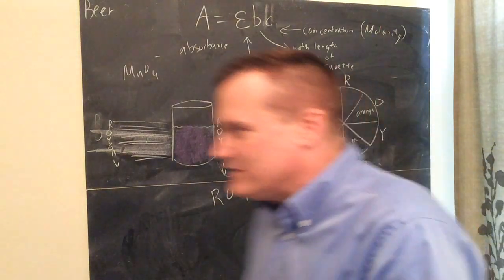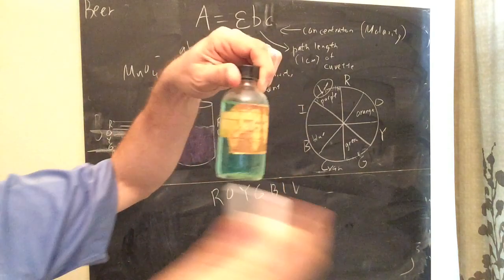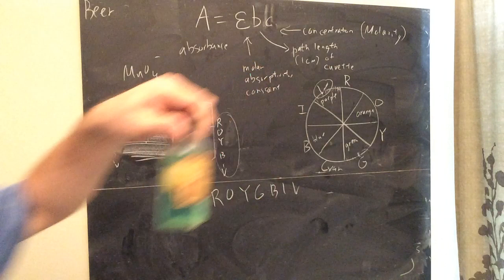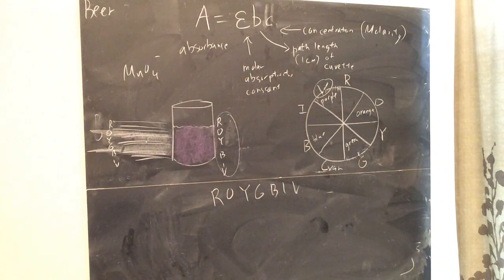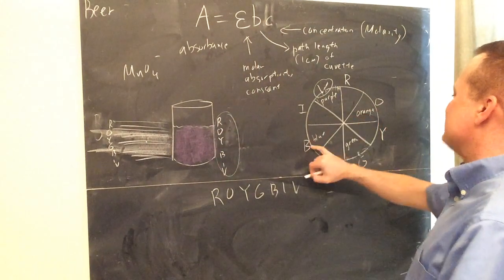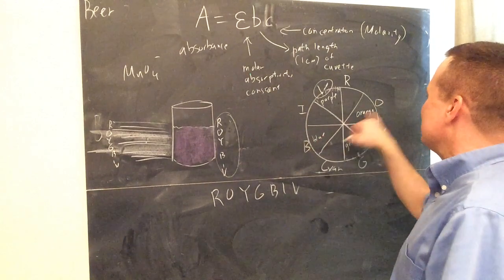So the one that we saw earlier, the nickel that I held up a moment ago, this is absorbing the mainly purple wavelengths of light. The other wavelengths are going through, and they're appearing to be, how do you say it? Green. Okay, what a weird thing. And then orange and blue, I always like that one because that's my school Auburn color. But yeah, blue, opposite. So that one, that's kind of interesting.